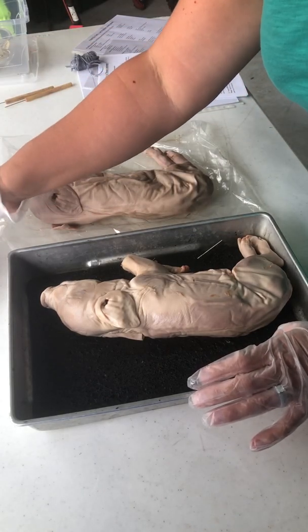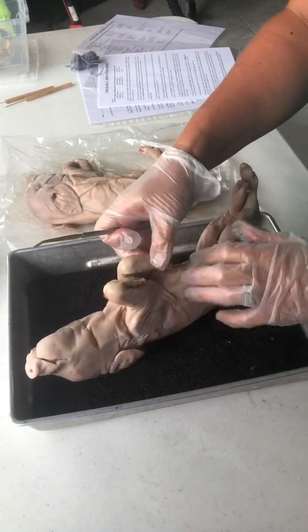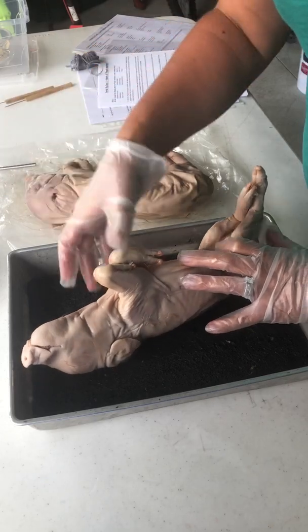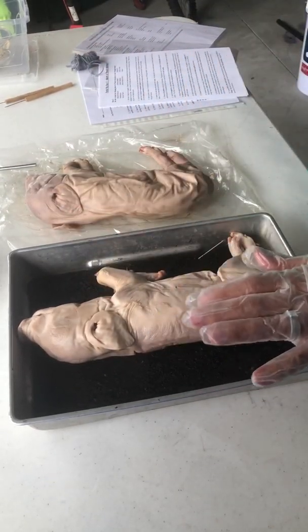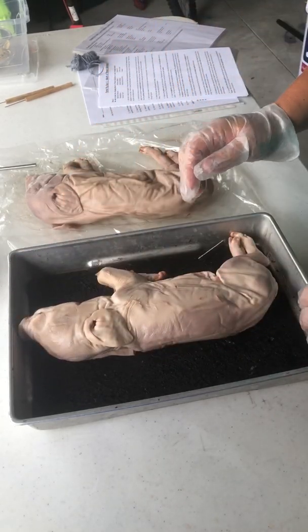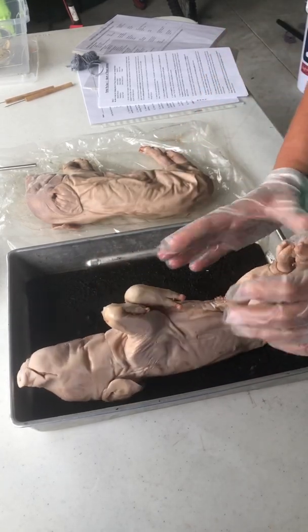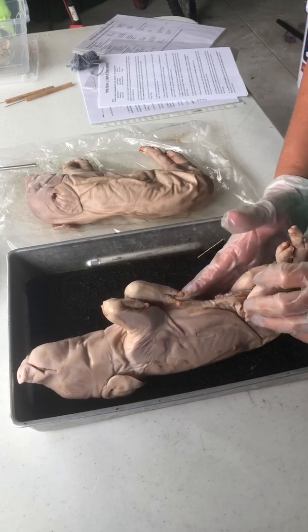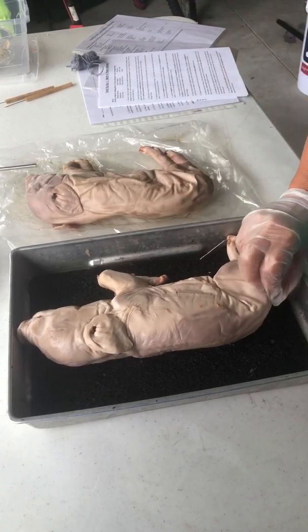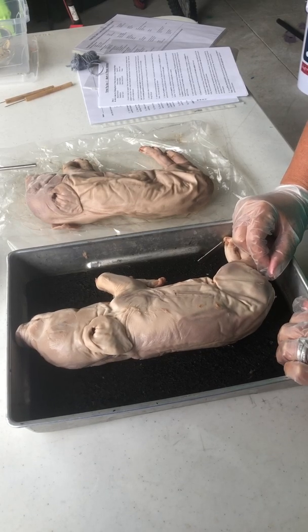So the first step, it says to obtain a fetal pig. Since we are doing this virtually, you're just going to observe me going through the actual dissection. We have to lay the pig on its side in the dissecting pan and locate the dorsal, which is the back. So this part of the pig is the dorsal portion of the pig. The ventral part is going to be the belly. And then the lateral, which is the sides and side surfaces. And then the anterior is the head, and the posterior is down at the bottom. You need to know these terms as you're going to be using them throughout the dissection.